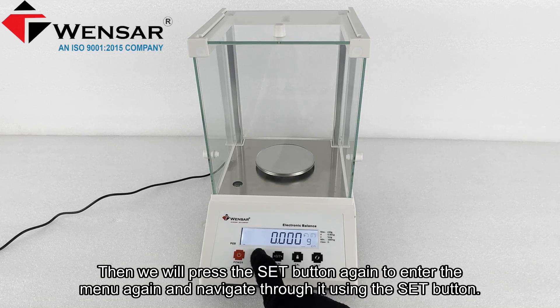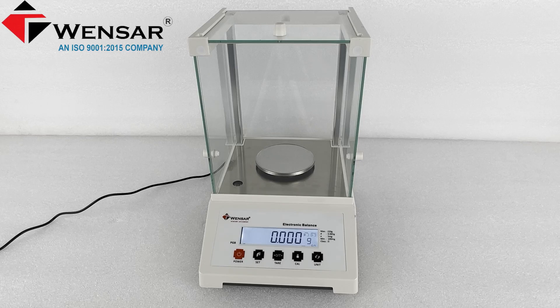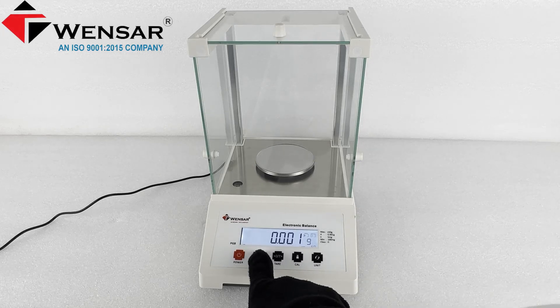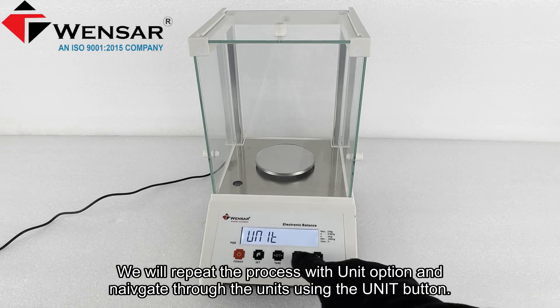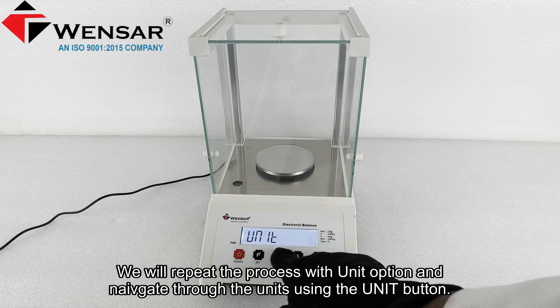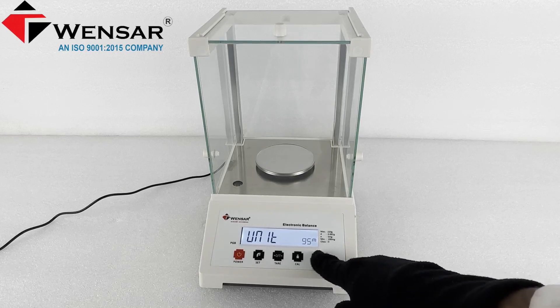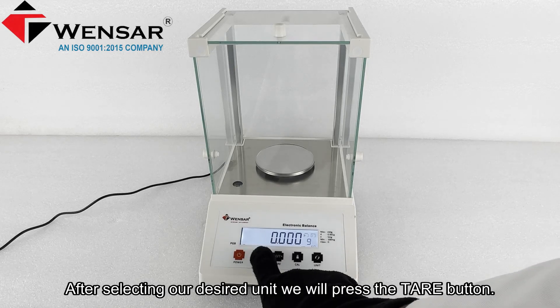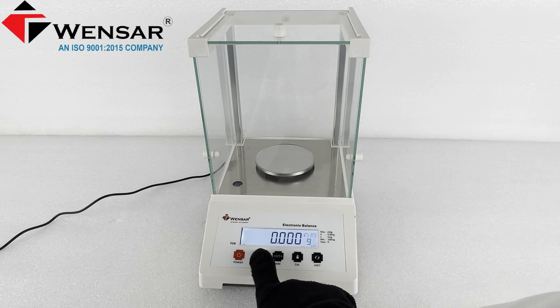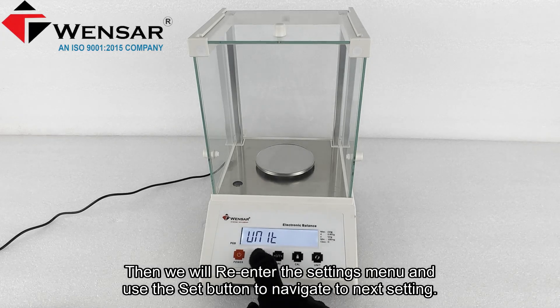Then we will press the set button again to re-enter the menu and navigate through it using the set button. We will repeat the process with the unit option and navigate through the units using the unit button. After selecting the desired unit, we will press the tare button to confirm, then re-enter the settings menu and use the set button to navigate to the next setting.